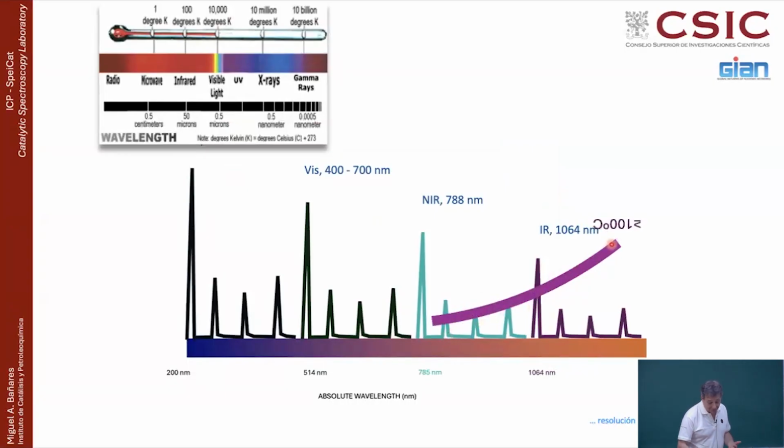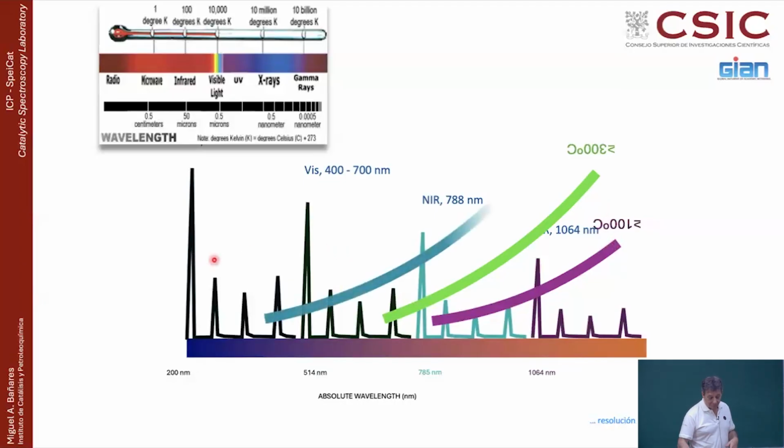The light coming from the sample will make it impossible to see Raman spectra. So, okay, I use a near-infrared laser. But if your sample is at about 300 plus degrees centigrade, near-infrared radiation will be coming out of your sample and you won't be able to see. Of course, you can look at those with visible and ultraviolet light. If you go to 800 and above, the sample will be bright red. It will be emitting light. It will be white, brilliant white.